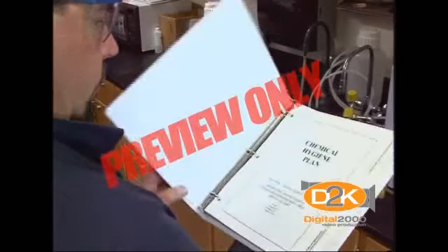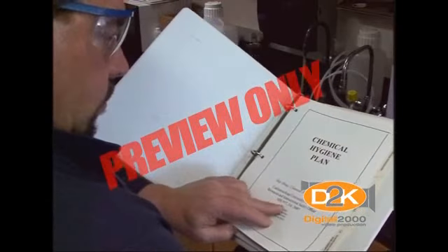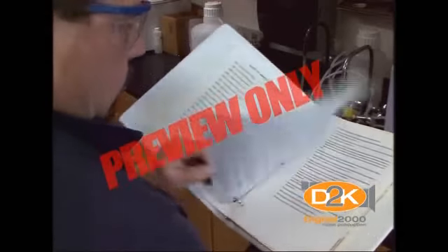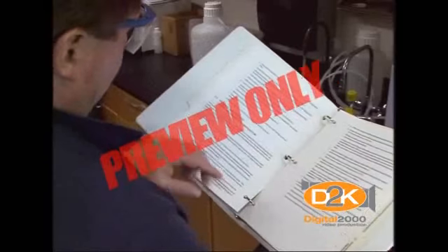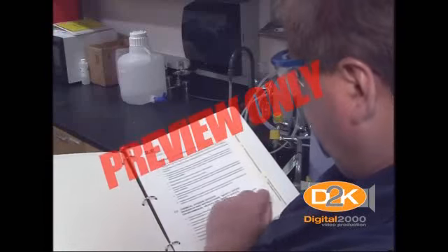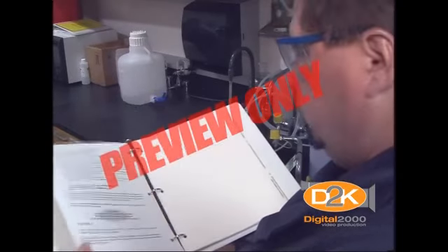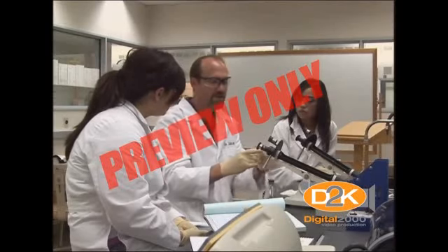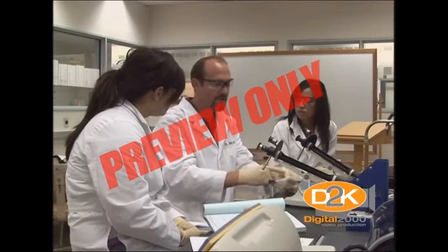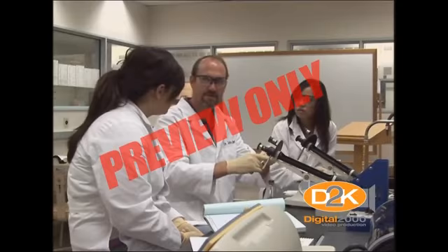In this program, we will cover what a basic chemical hygiene plan is and how you can use this information to stay safe and healthy in a learning environment. A chemical hygiene plan is a written program developed and implemented by your university. This plan sets out procedures, equipment, personal protective equipment, and work practices that are capable of protecting you.